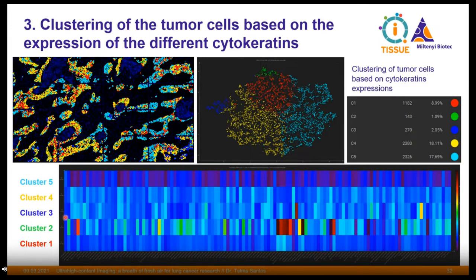So in a case like this, what we could do is plot these three clusters against each other, ignoring these two, to see the big differences between them. Of course, when you have smaller clusters, chances are that you're going to see bigger differences. And here, as you can see, some of the cells, the blue cells here and the green ones, are very few in amount. You can barely see them. So this might be just very, very specific kinds of cells.